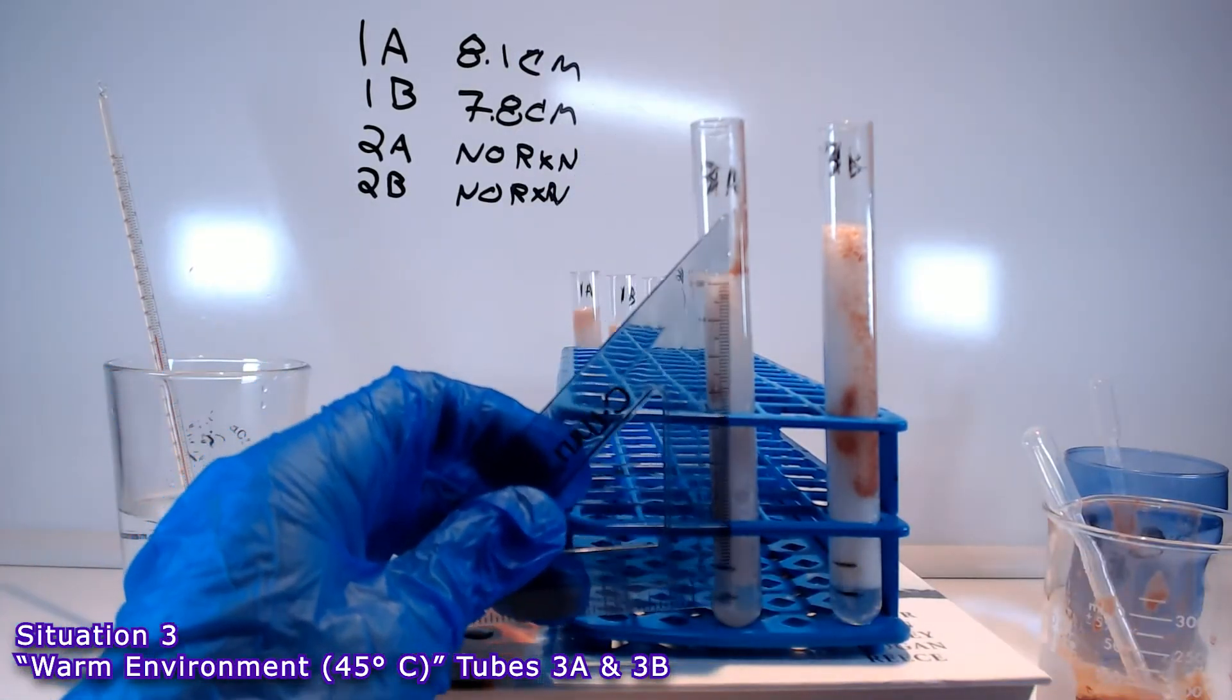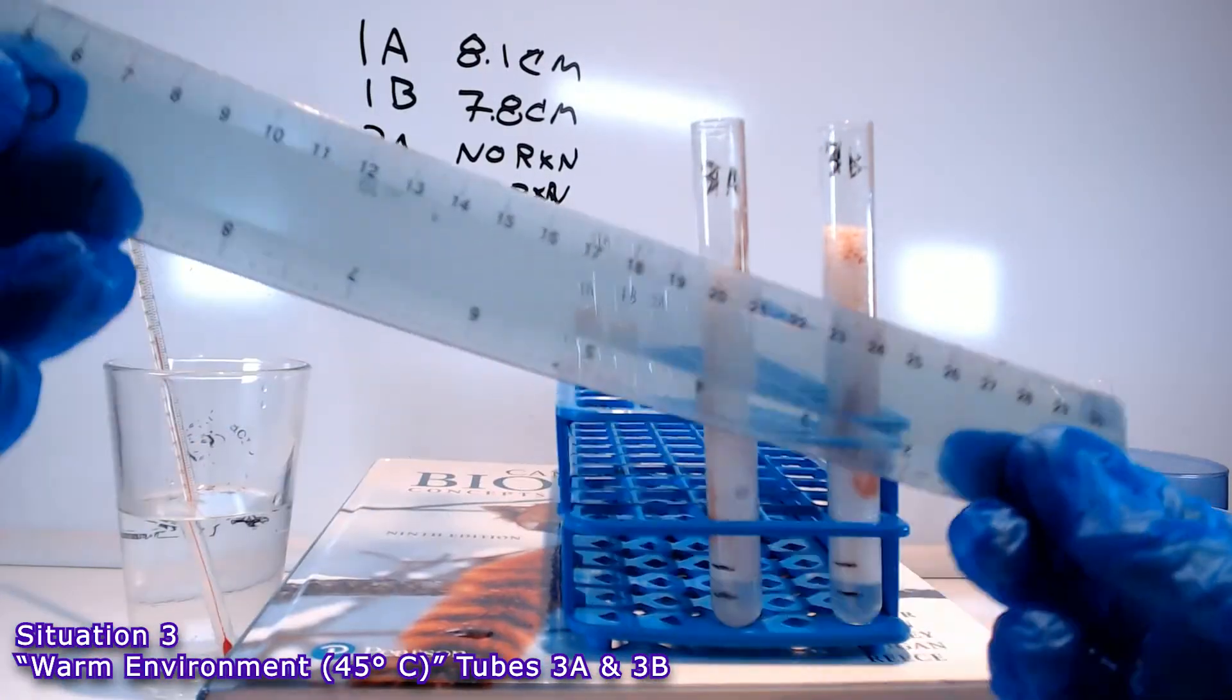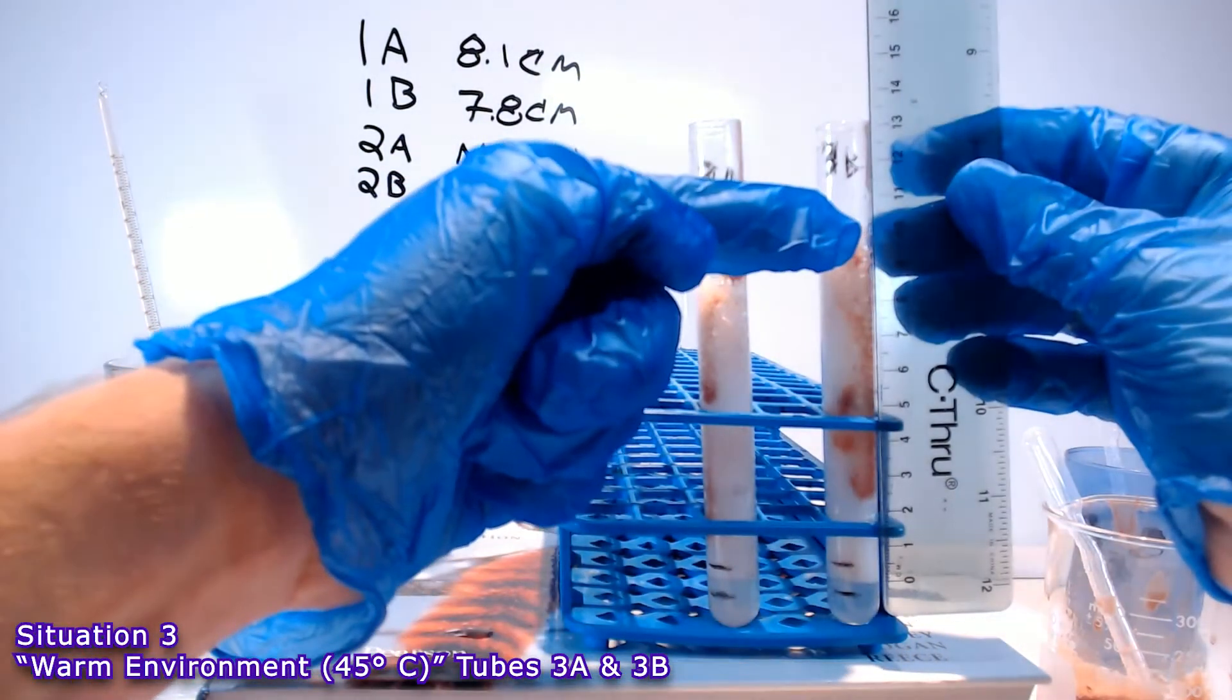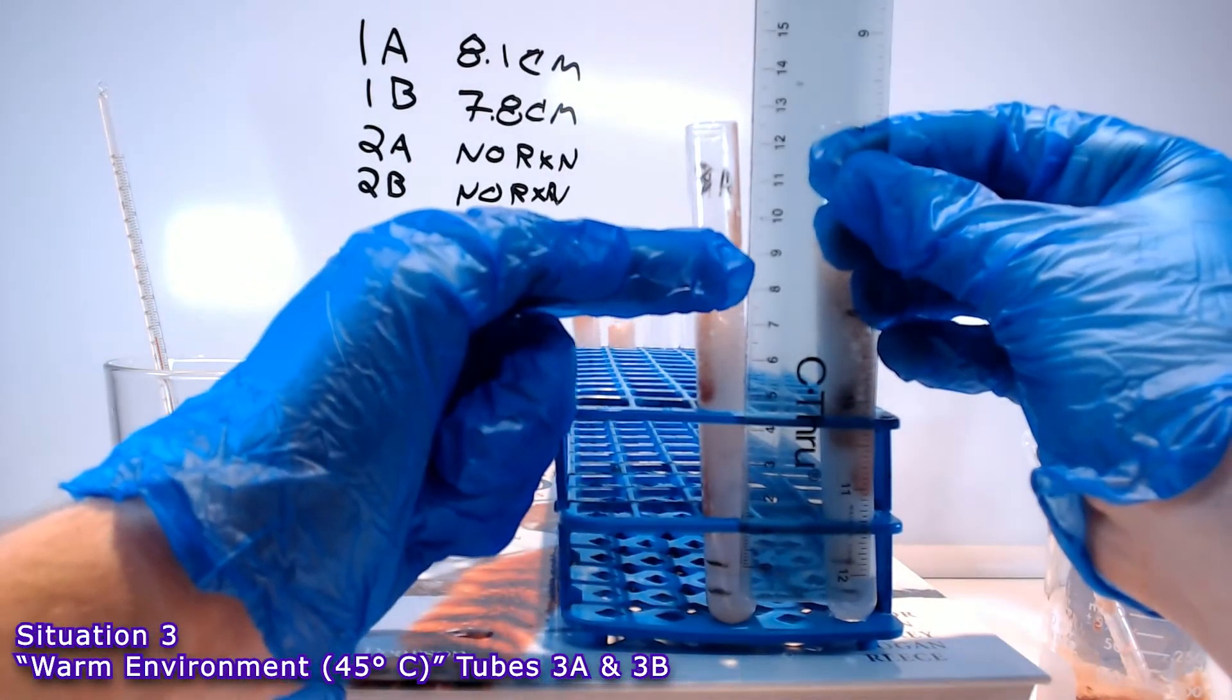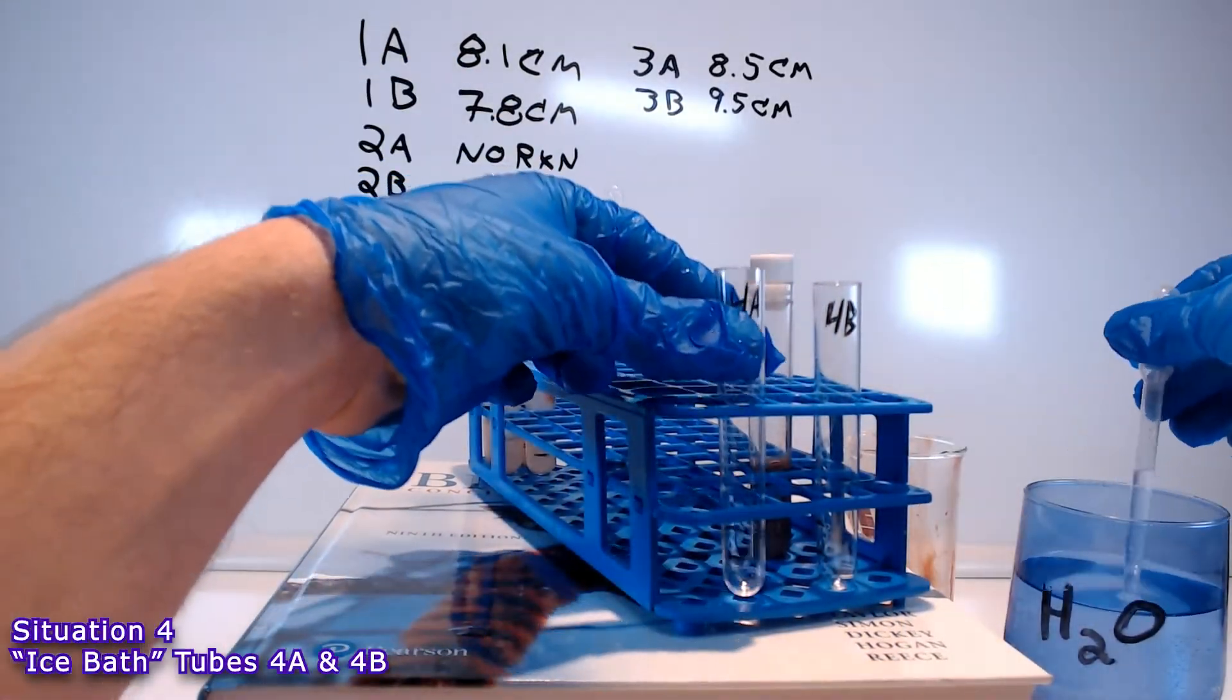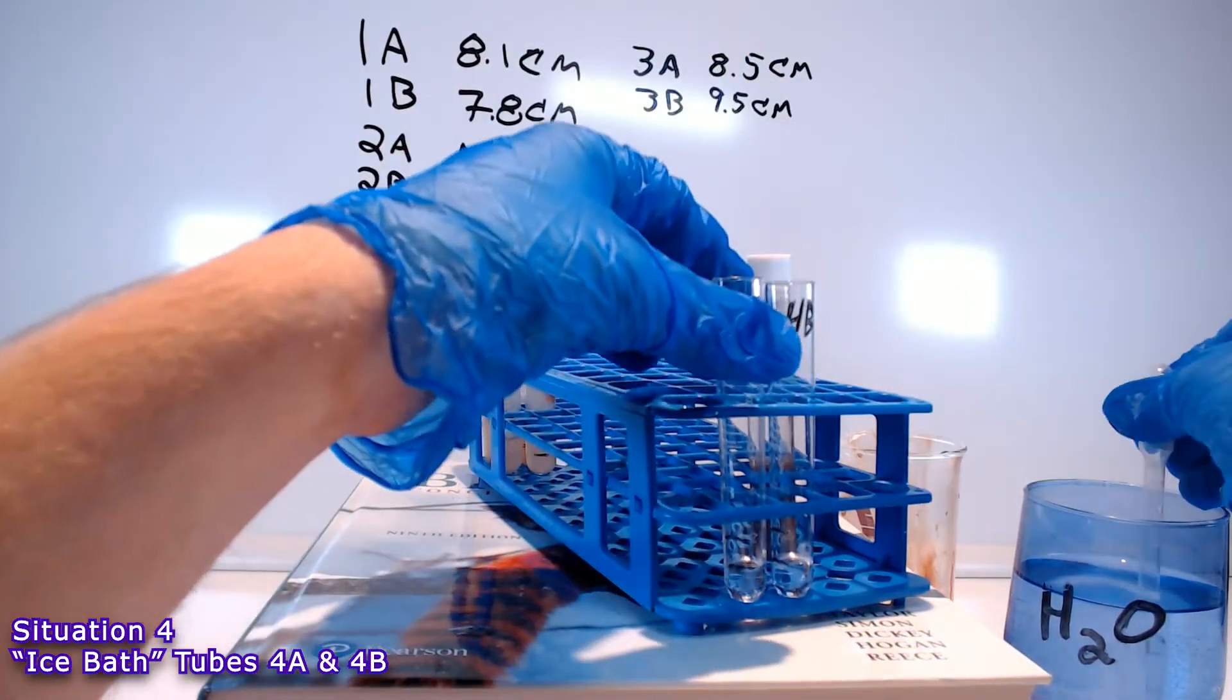And in fact, it's so many bubbles that this tiny little ruler that I had is no good. I'm measuring from the 2 centimeter line that was the top up to the top of the column of bubbles there, not from the bottom of the tube. So, at the end, it turned out that in the warm environment, we got 8.5 centimeters for tube 3A and 9.5 centimeters for tube 3B.